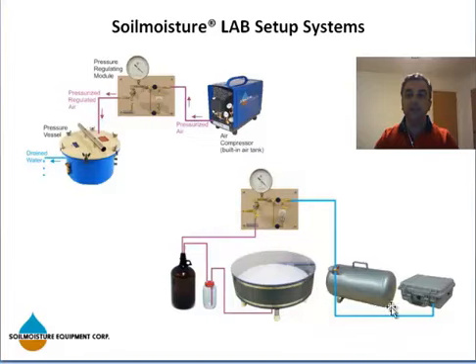Our vacuum has a big label that says that the tank should not be used for pressurized application beyond 8 bar, and it also has a safety valve. Our air tank has a safety valve.